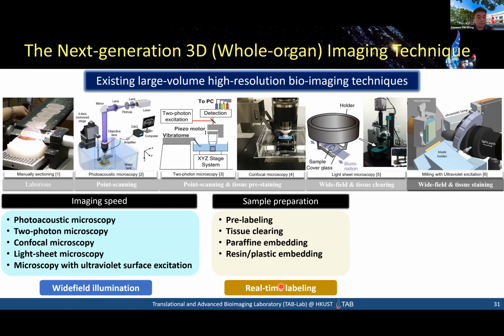So is it possible to do real-time staining? That means I immerse the tissue inside a tank with a lot of stains, and stain during the imaging process. So that's what we dream about.